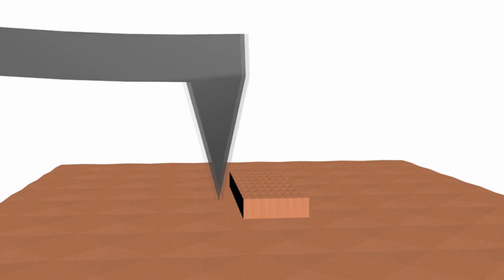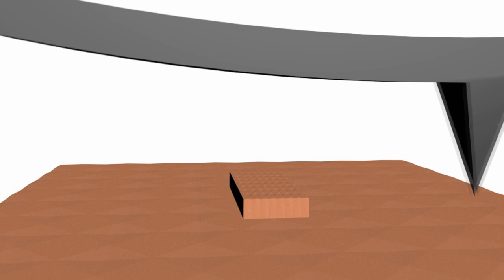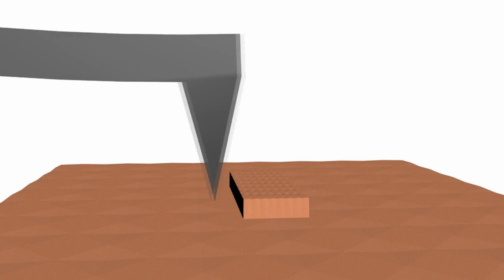There are three basic AFM imaging modes: contact, non-contact, and tapping mode. In the case of contact mode, the tip is in contact with the surface. This is good for studying hard surfaces.